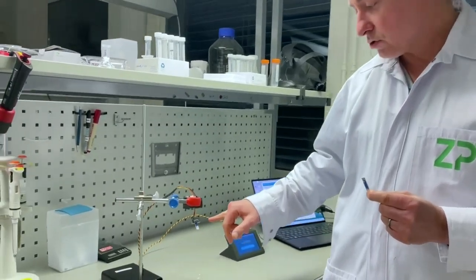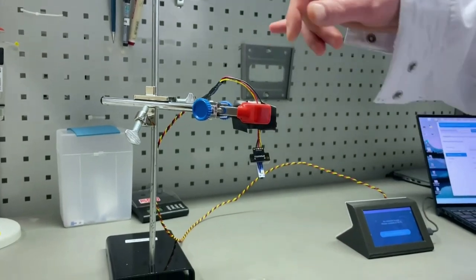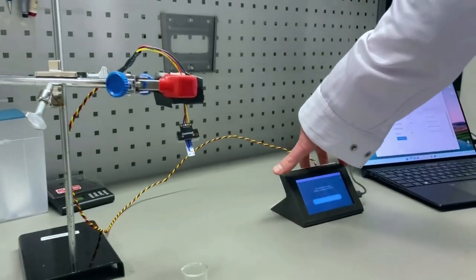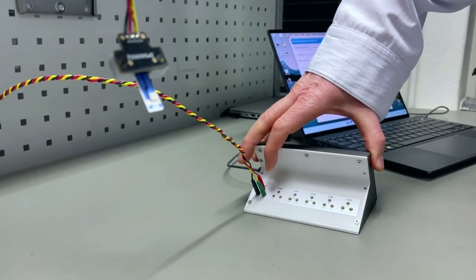The screen-printed electrode is connected into one of our connectors. I'm going to turn this round for you very quickly — there are actually six channels on this instrument.